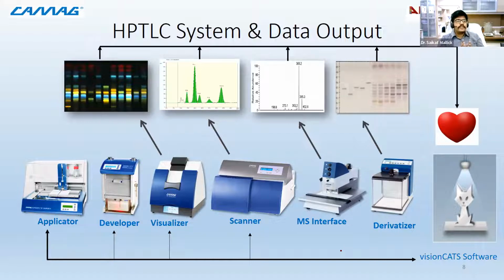Then we have the developing device, which is a very important aspect of this chromatography, because separation is where the important aspect happens, that is the components get resolved. So you have to concentrate. When we go to the demo session, I'll give you some practical insights also on this development part, like the mobile phase, what should be a good mobile phase, how can you develop and things like that. I'll be talking more as we move into the demo part.